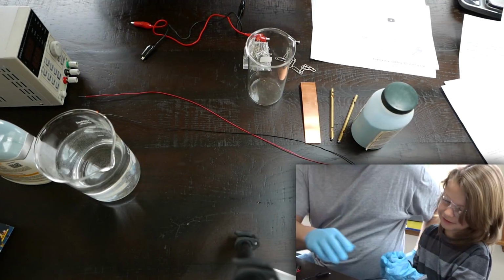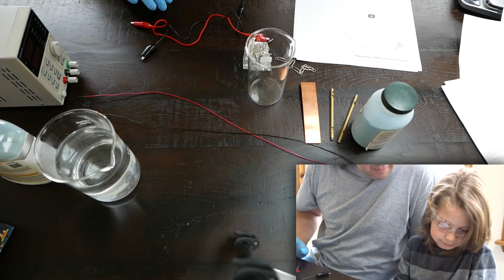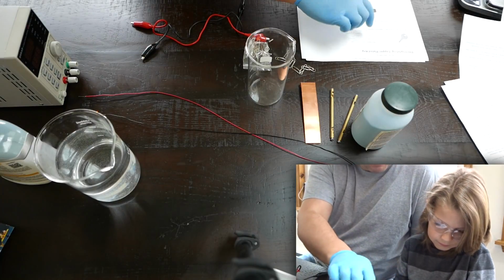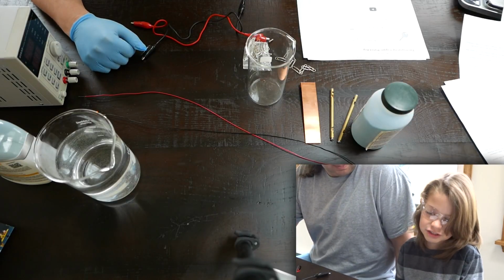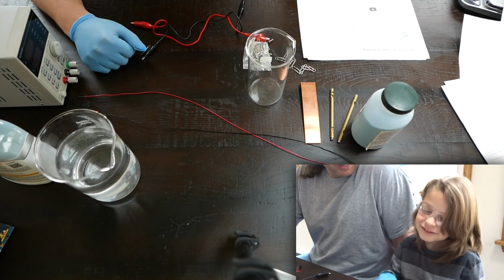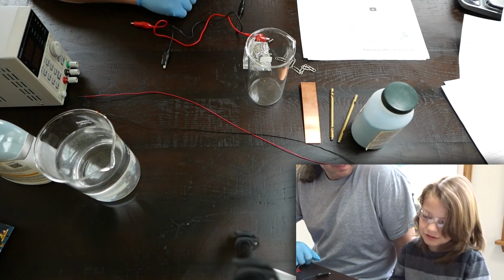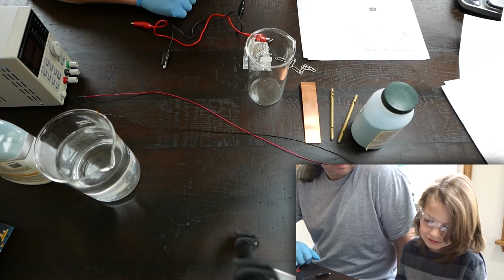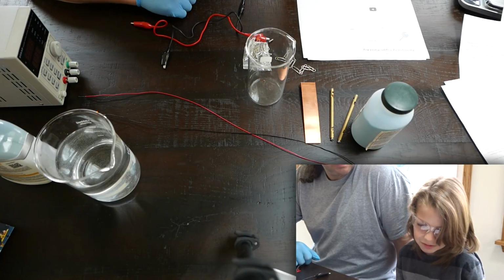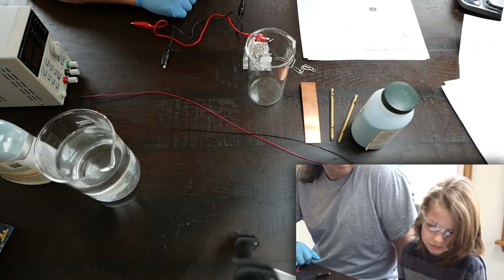So where do we get these from? These came from Home Science Tools, electroplating, copper. You want to read up a little bit there? Electroplating uses a form of electrolysis. We're going to do another experiment on electrolysis later on, okay? In which the electrodes play a bigger role than just conducting the current. Using electricity, you can coat the metal of one electrode with metal of the other.